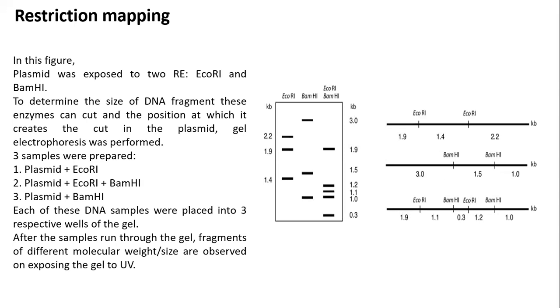Also, you can use this restriction mapping to confirm your DNA sequence in a plasmid. So these techniques can be used for molecular cloning, as well as to get information about unknown DNA fragments. And this is used routinely in labs to check molecular clones or unknown DNA fragments.